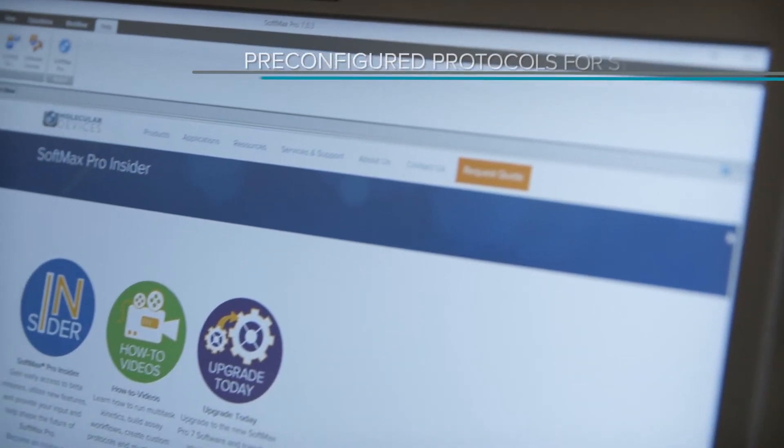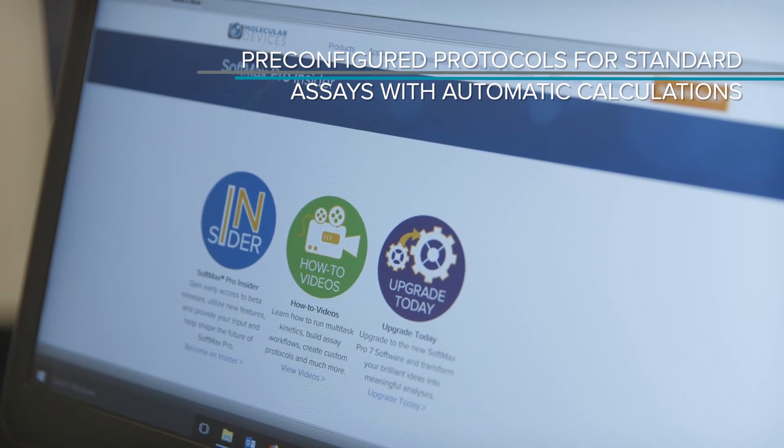SoftMax Pro software makes comprehensive data analysis fast and easy.